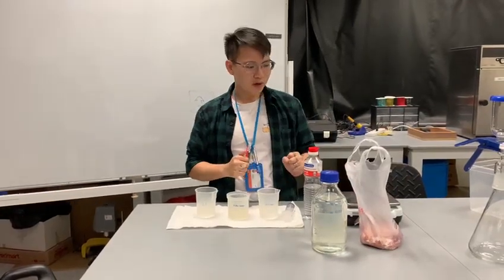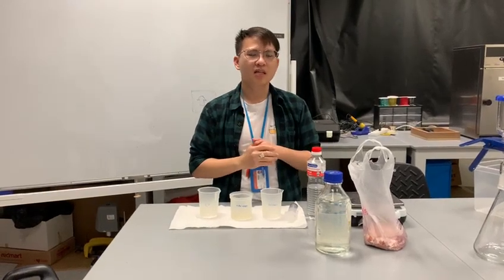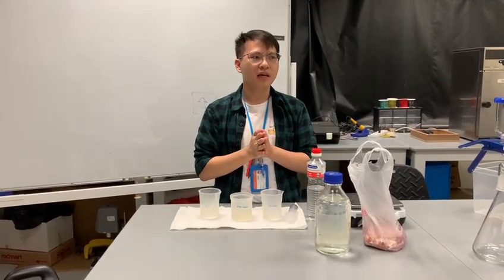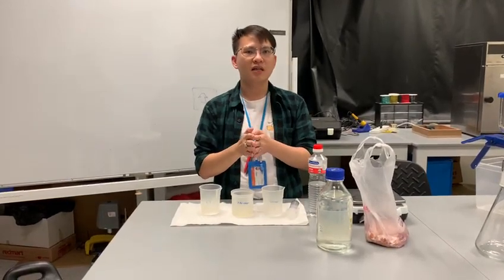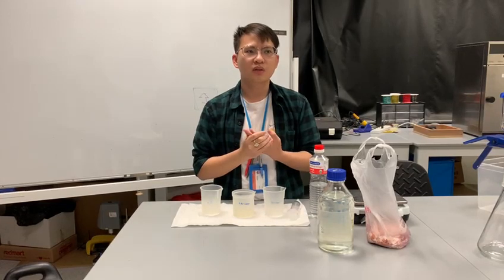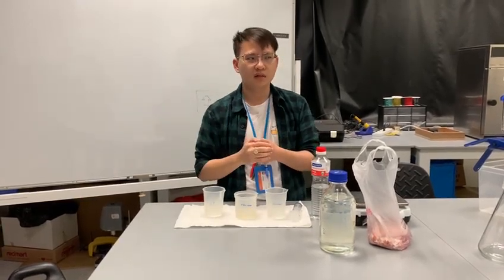In this experiment, why we want to measure the change in the mass is because when you react an acid with calcium carbonate, carbon dioxide is liberated in the process, so the mass will decrease because of the release of the gas.